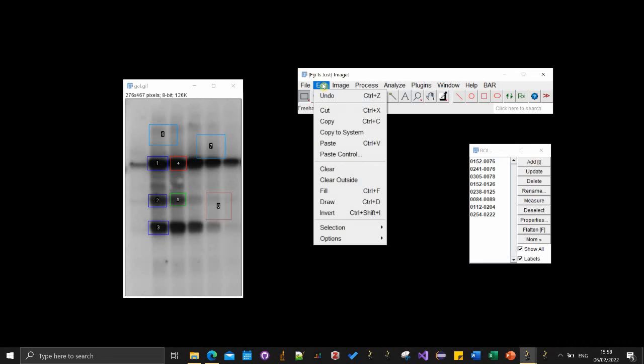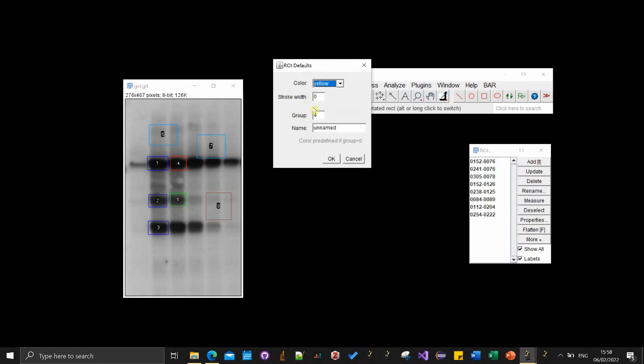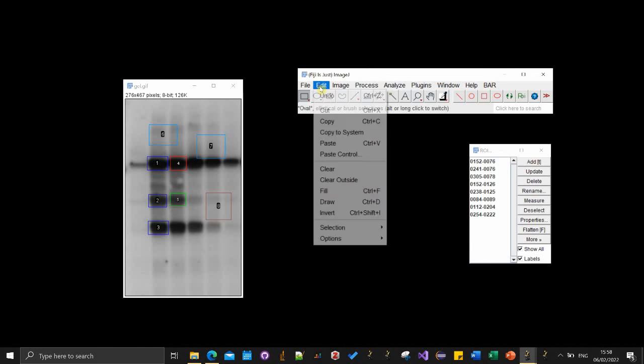And so I mentioned before, you can also associate a category name to the group, so that's optional. The way to do it again is to double click this one, and for each of them enter the name that you want, and by default it's going to be unnamed if there's nothing defined. Now I can update number 6, let's say it's going to be test.